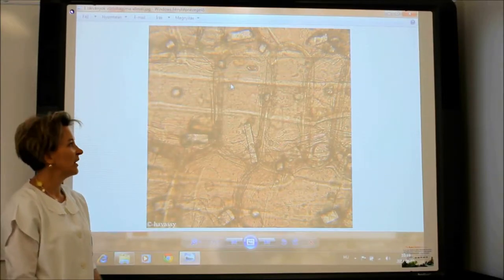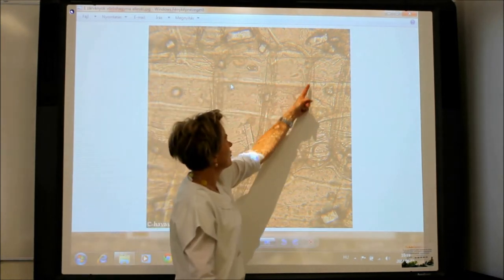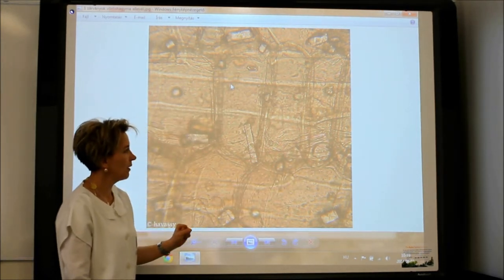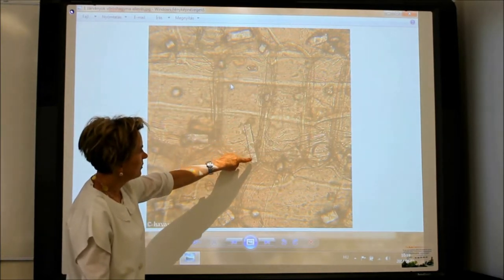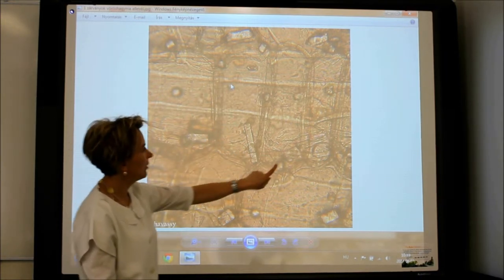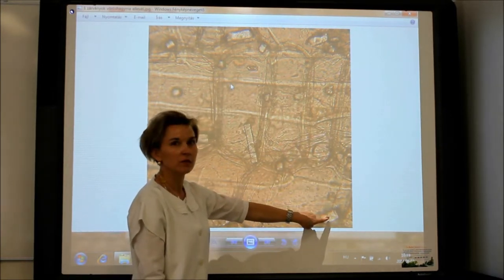In the examined sample, the tight fitting of plant cells through the cell wall is observable. Visible are column-like solid crystals, which can consist not only of such columns, but also of twin crystal structures visible here, and also at the bottom here.